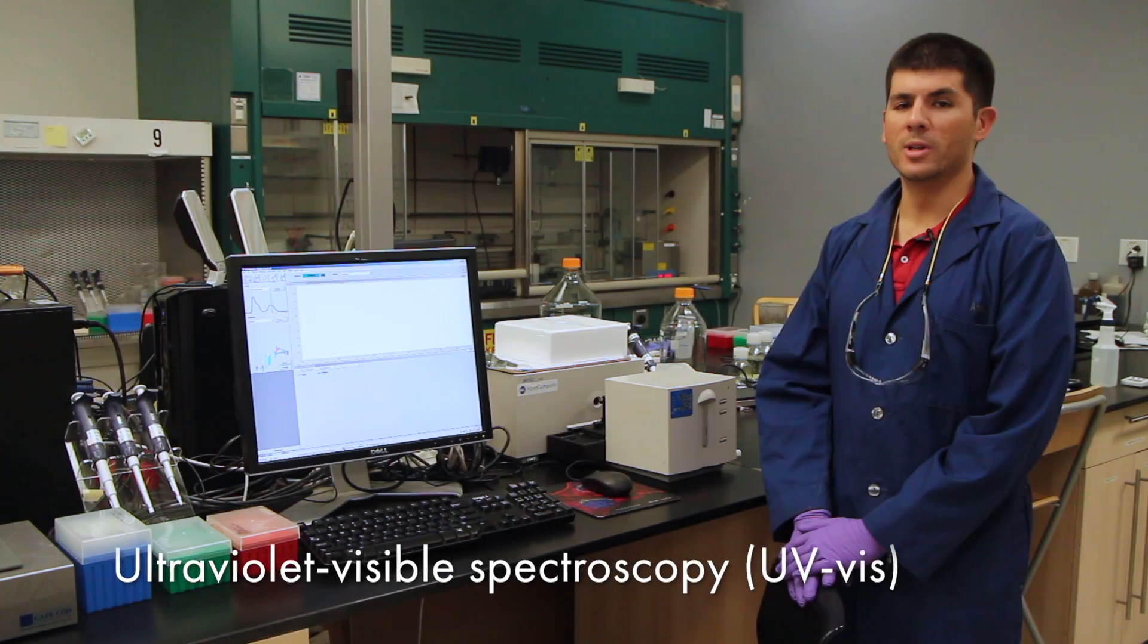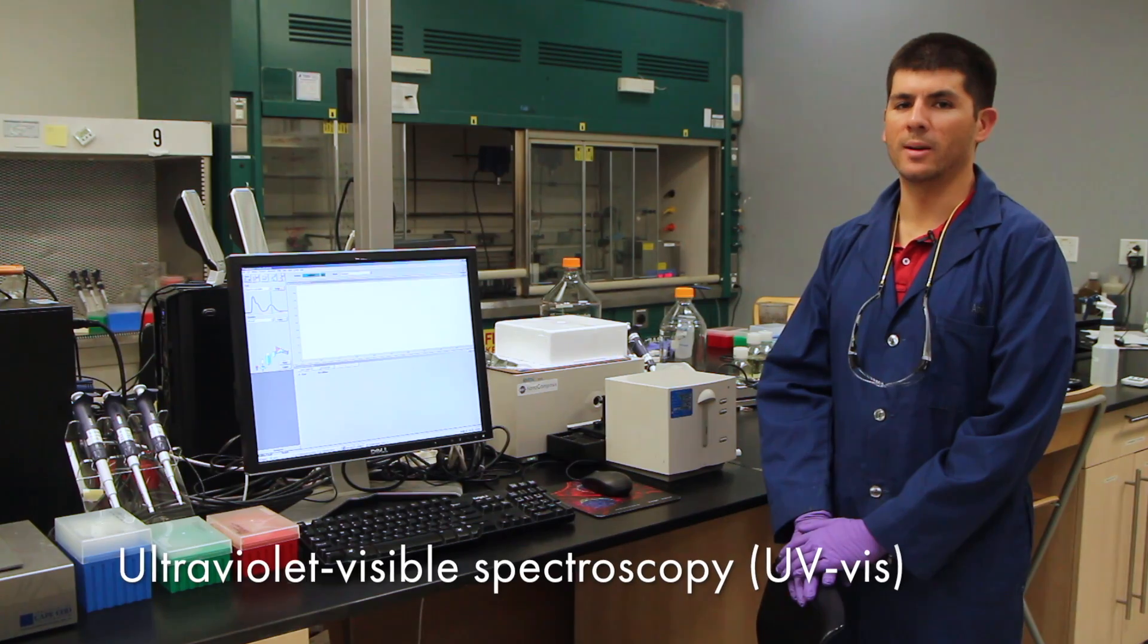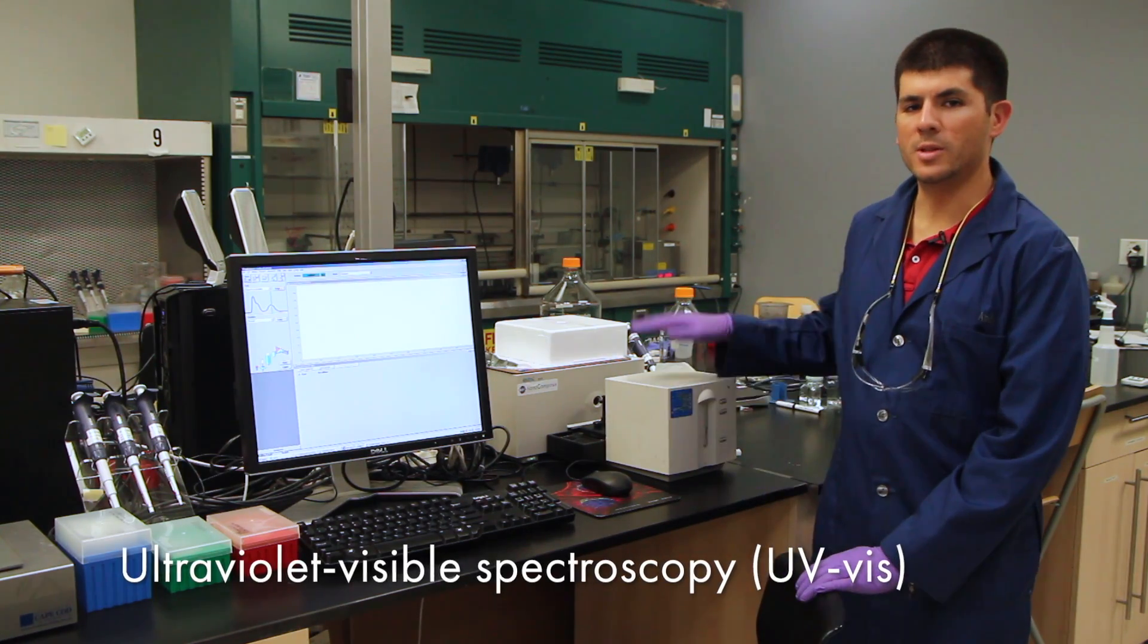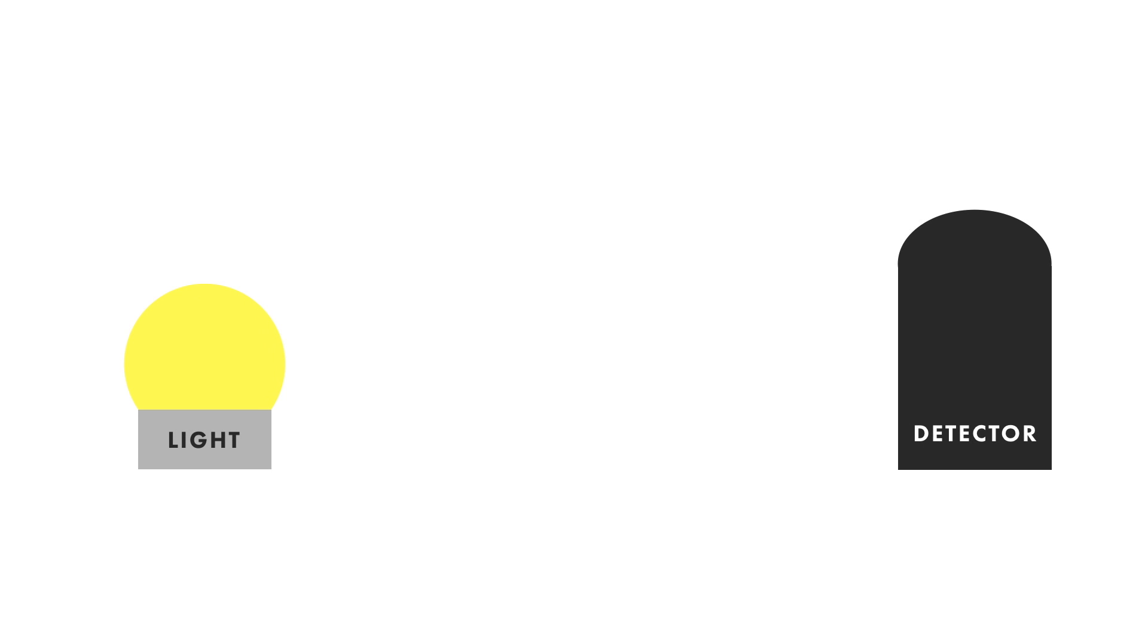To understand how our particles absorb and scatter light, we use a UV-Vis spectrophotometer. Not only do you learn optical properties, but the spectra from UV-Vis measurements can also be used to evaluate particle size, shape, concentration, and whether or not your particles are aggregated.